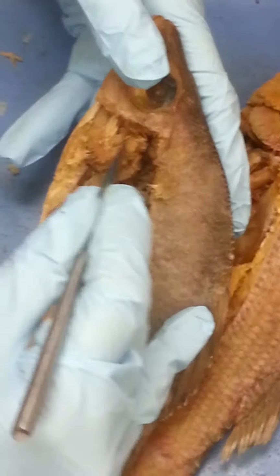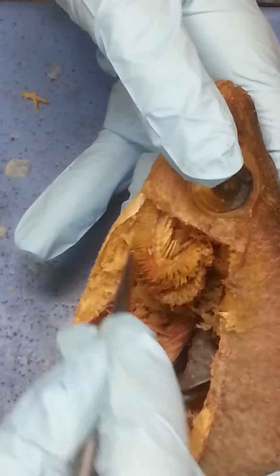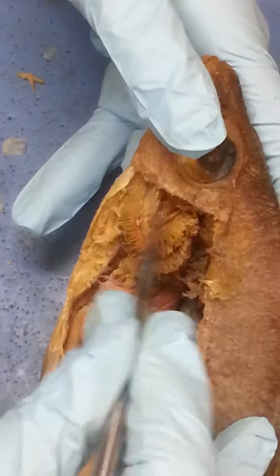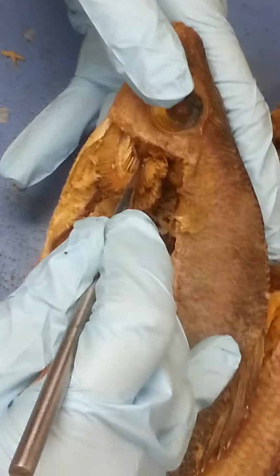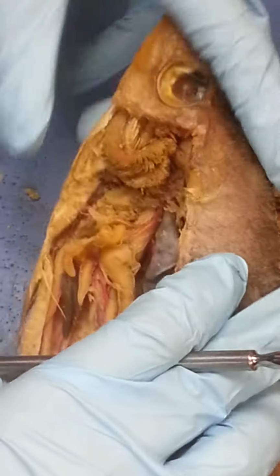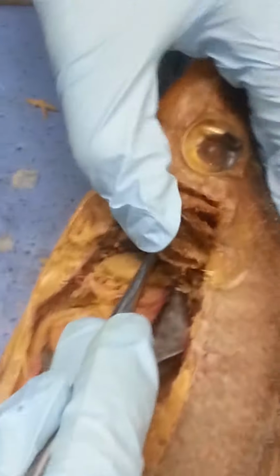Okay, then you have the gills. These little feathers are the gill filaments. And these hardened ones are the gill rakers. Okay, inside. All right. Then inside here is your heart.